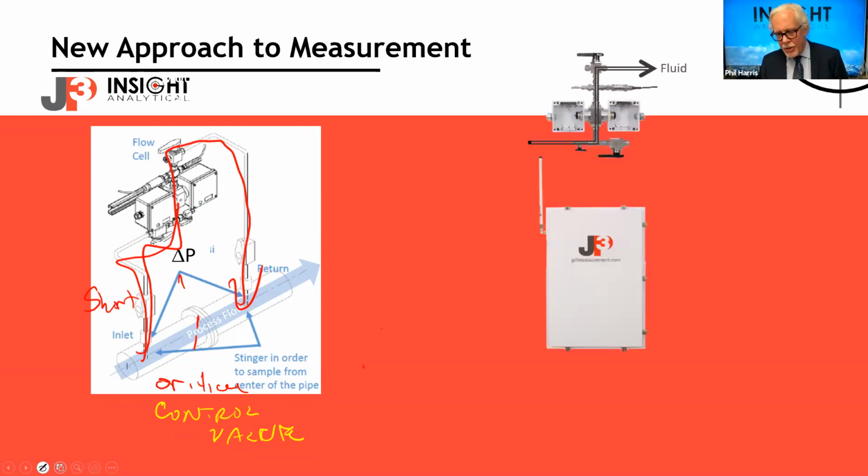So we already talked about having a better spectrometer. Now we talk about a better way of sampling. The other thing is these flow cells are large-ish diameters. Everything on this whole thing is run in half-inch tubing or pipe. So we've got large diameters. One of the big issues we have when we put conventional technologies in is that things plug off really easily. If I put in a chromatograph and I've got 1/8 inch and 1/16 inch tubing, it plugs on me. Now I run everything in half-inch tubing and pipe through this flow cell that doesn't have much of a flow obstruction. Things don't plug off very easily.